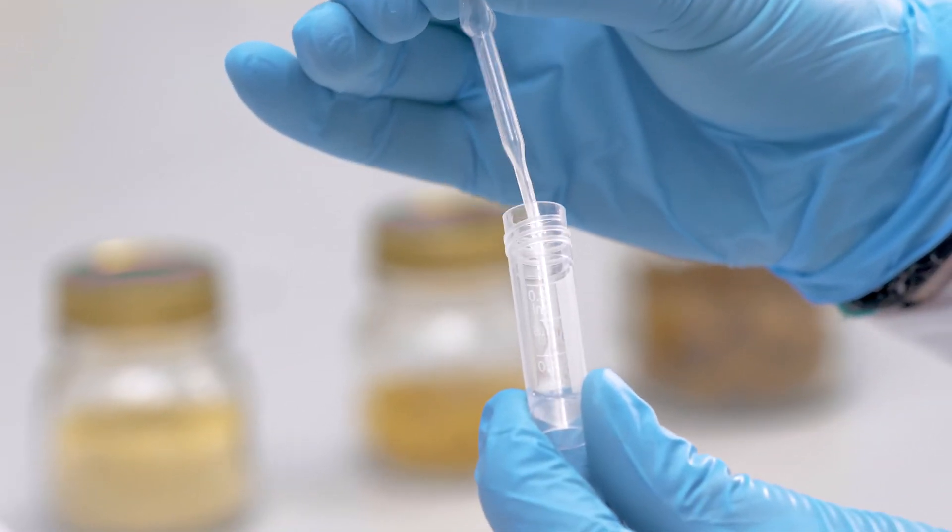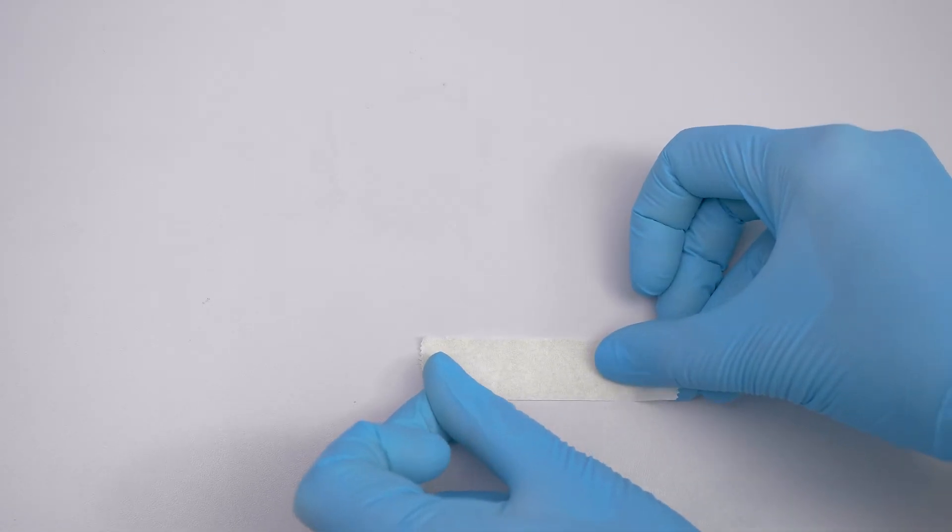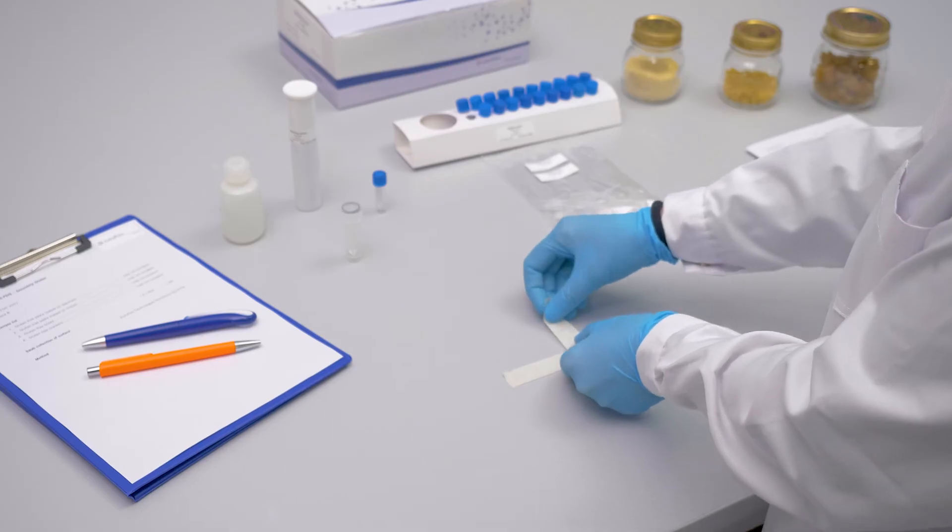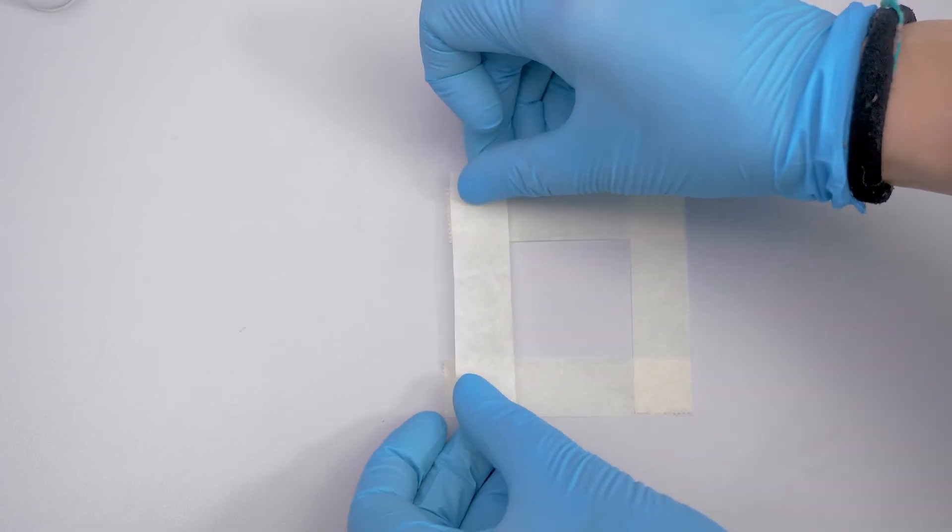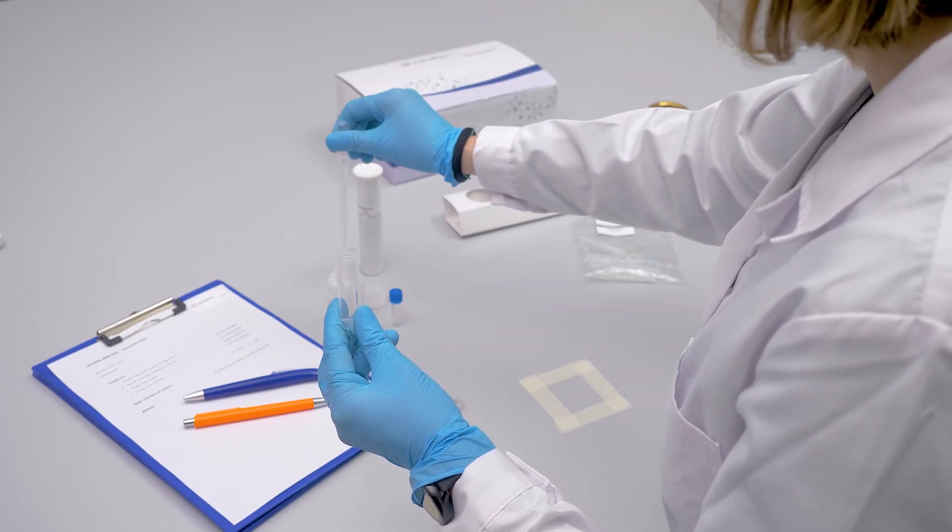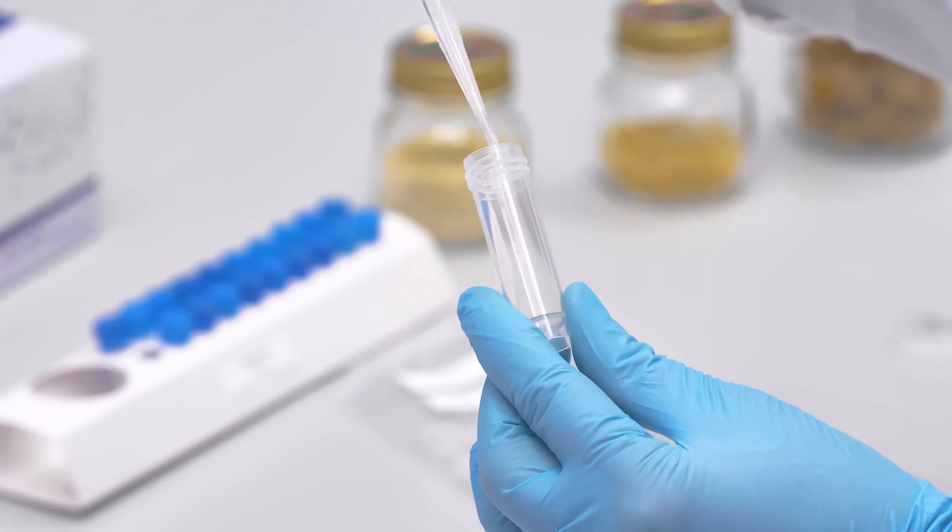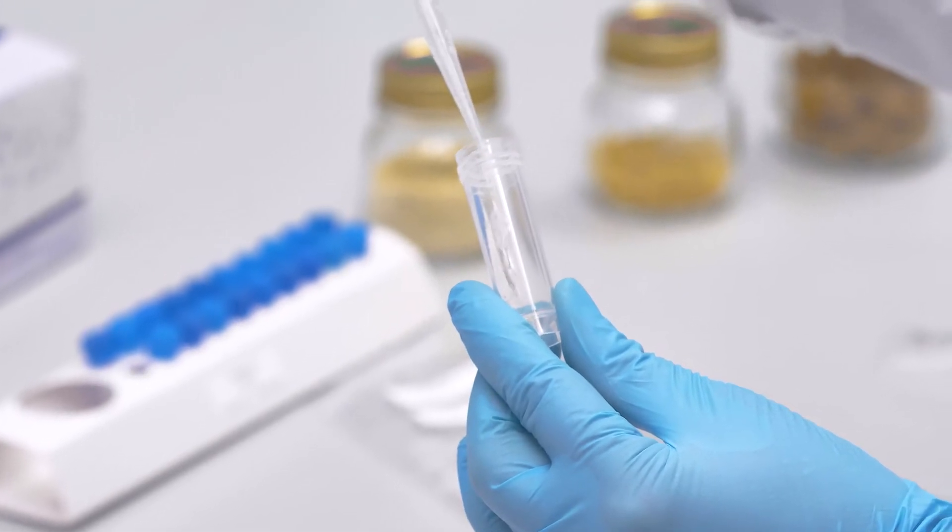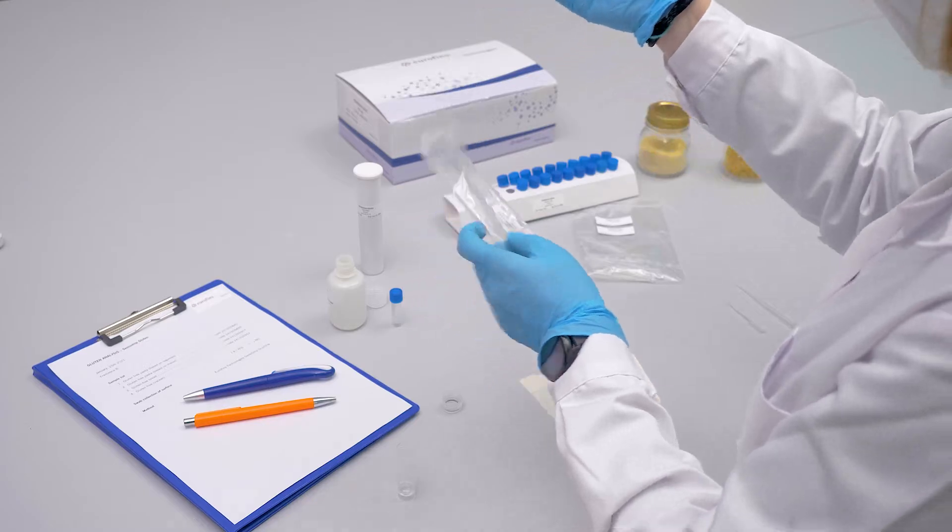The kit can also be used directly on surfaces to monitor the efficacy of cleaning operations or to exclude potential contamination. Identify and outline an area of approximately five centimeters by five centimeters on the surface to be tested. Transfer 1 milliliter of the ready-to-use dilution buffer into the extraction tube and dip the swab into the tube before swabbing the surface.